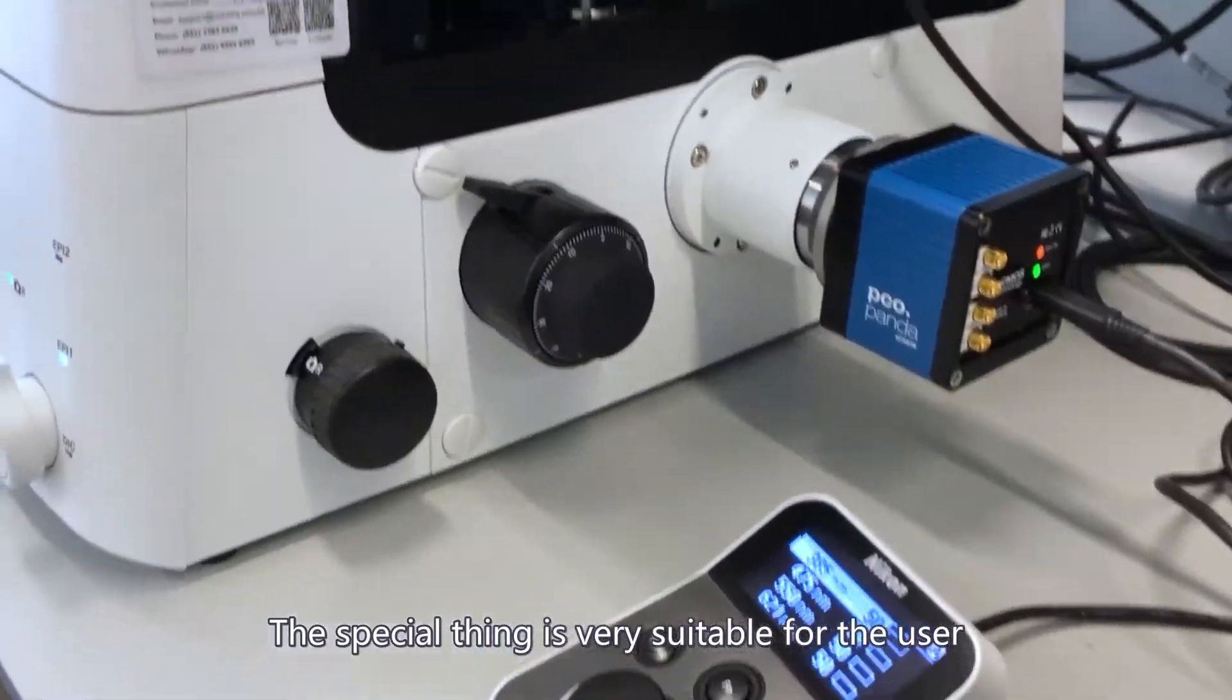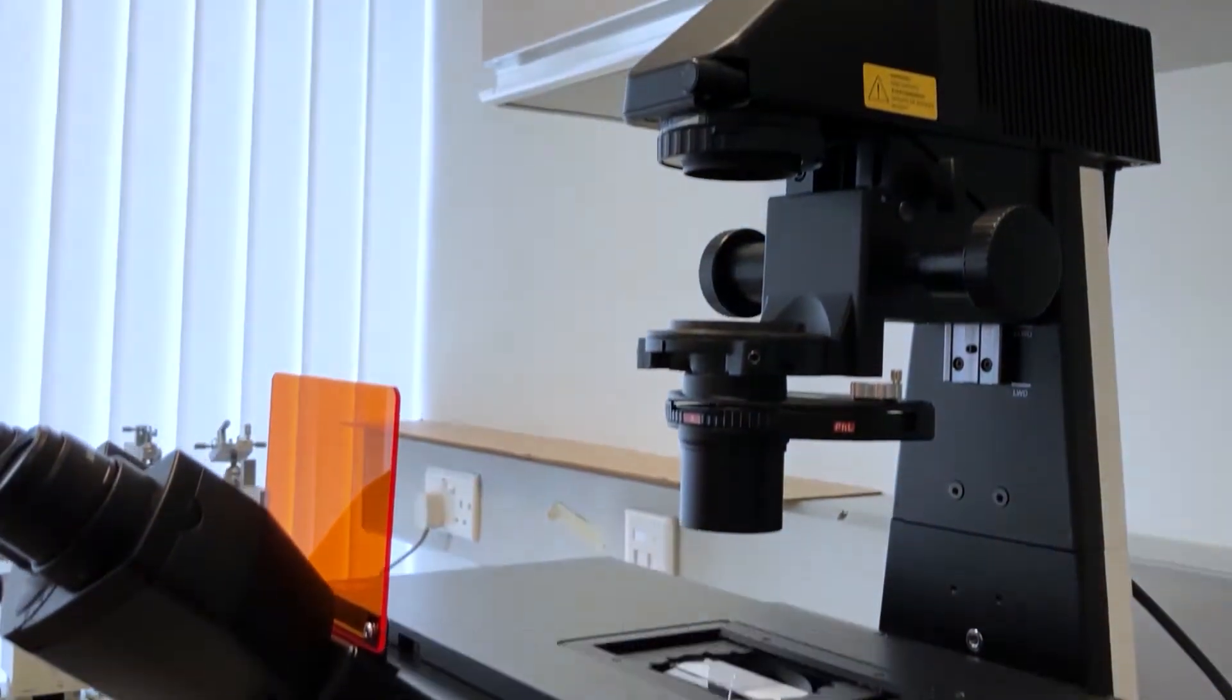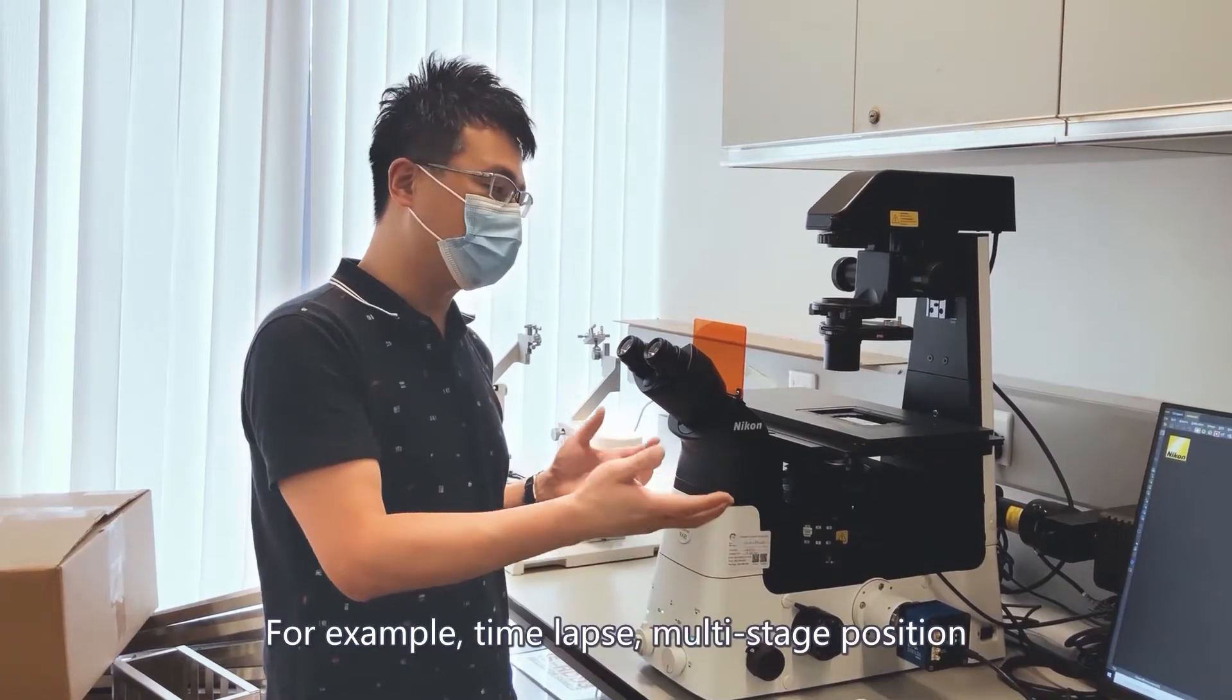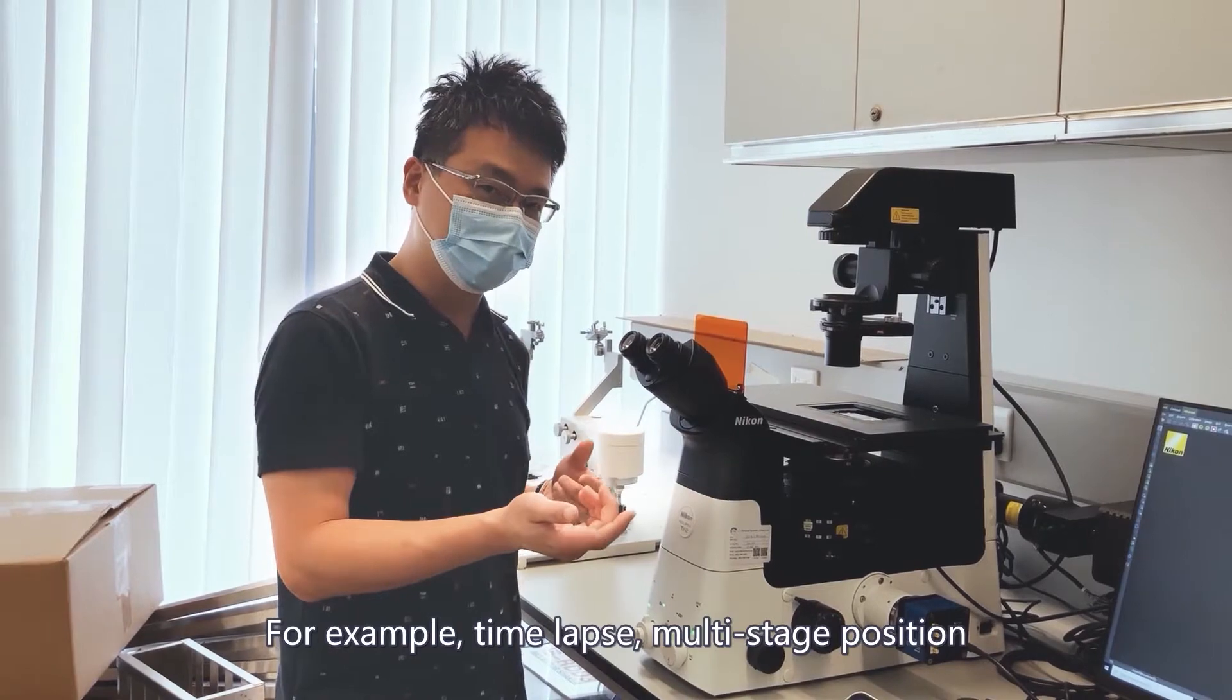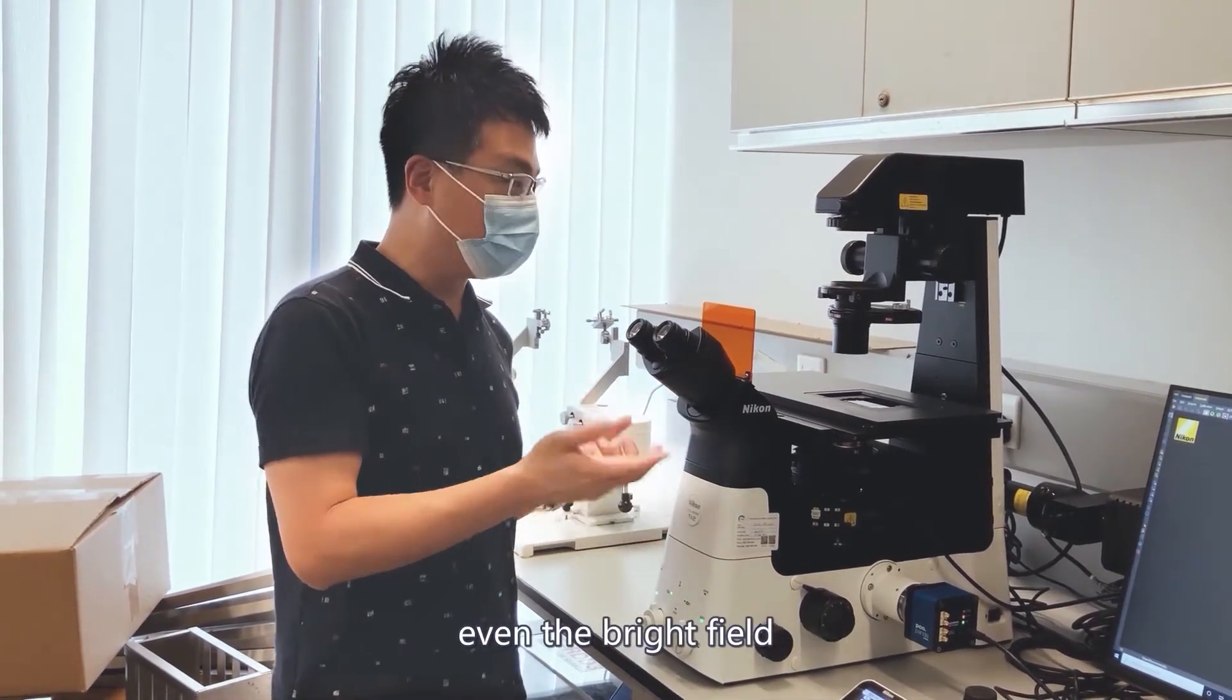The special thing is it's very suitable for users who have a very limited budget but want to do motorization, for example time-lapse, multi-stage position, multi-channel fluorescence, even brightfield.